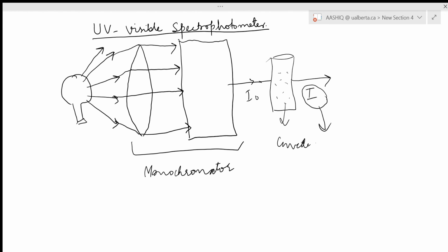But the spectrophotometer records absorbance or transmittance. So, this thing which comes out is an electromagnetic radiation, right? And what we get on the spectrophotometer is a digital signal, right? For example, for absorbance, we get values like 0.005, or we may get a 0.05 absorbance value. What is the device that converts these electromagnetic radiations into these digital signals, into these electrical signals? That part of the UV visible spectrophotometer is called the detector, right?